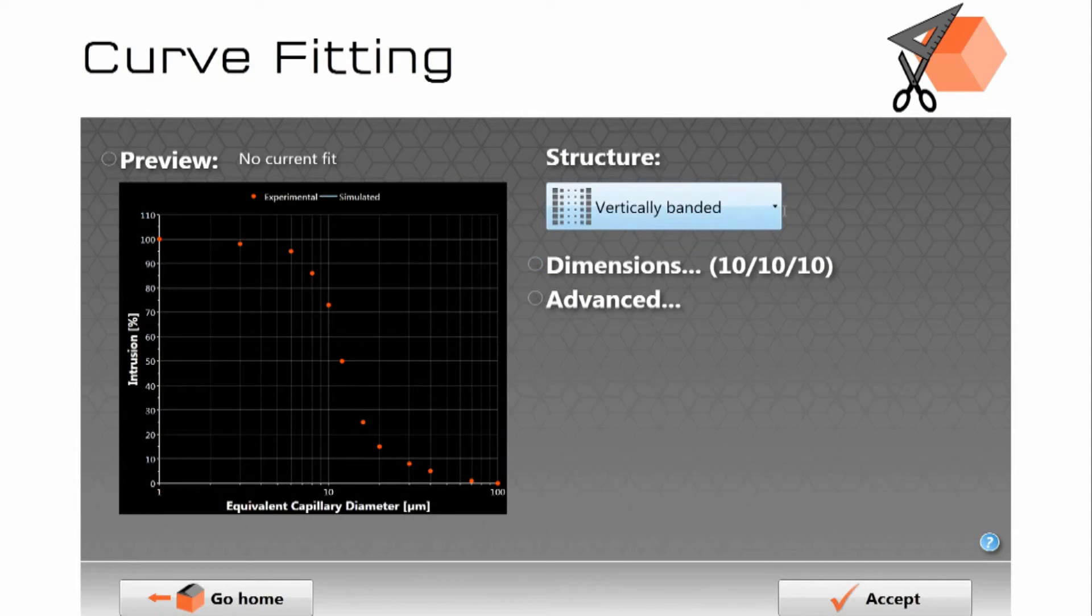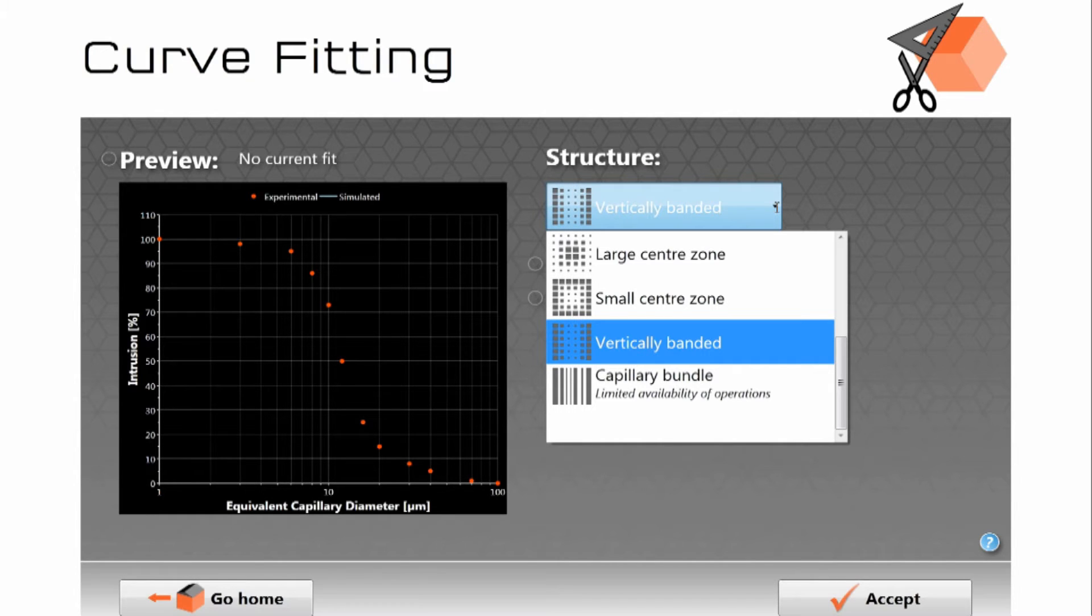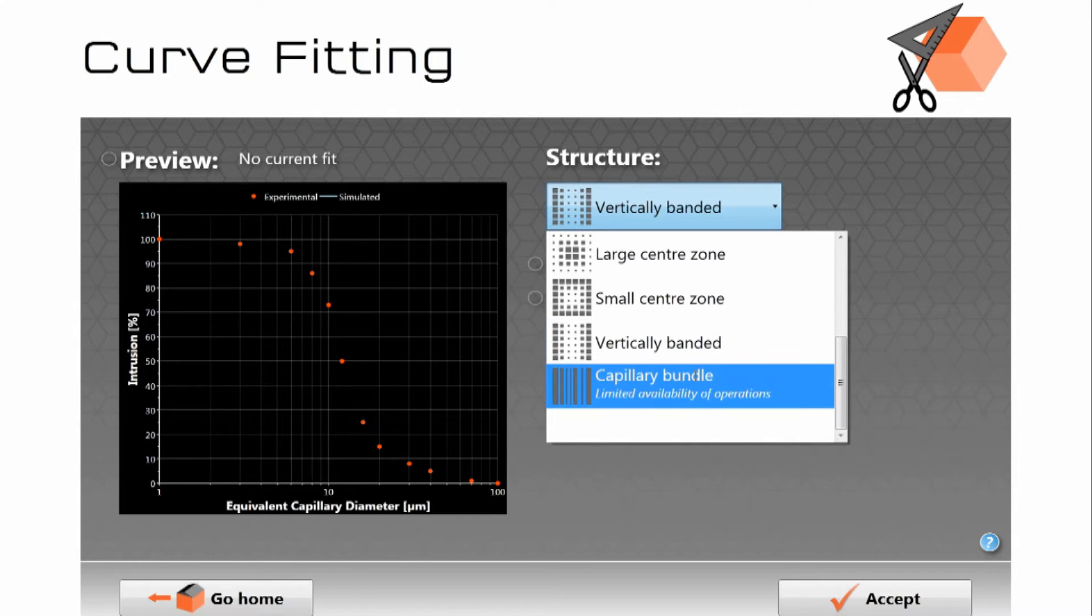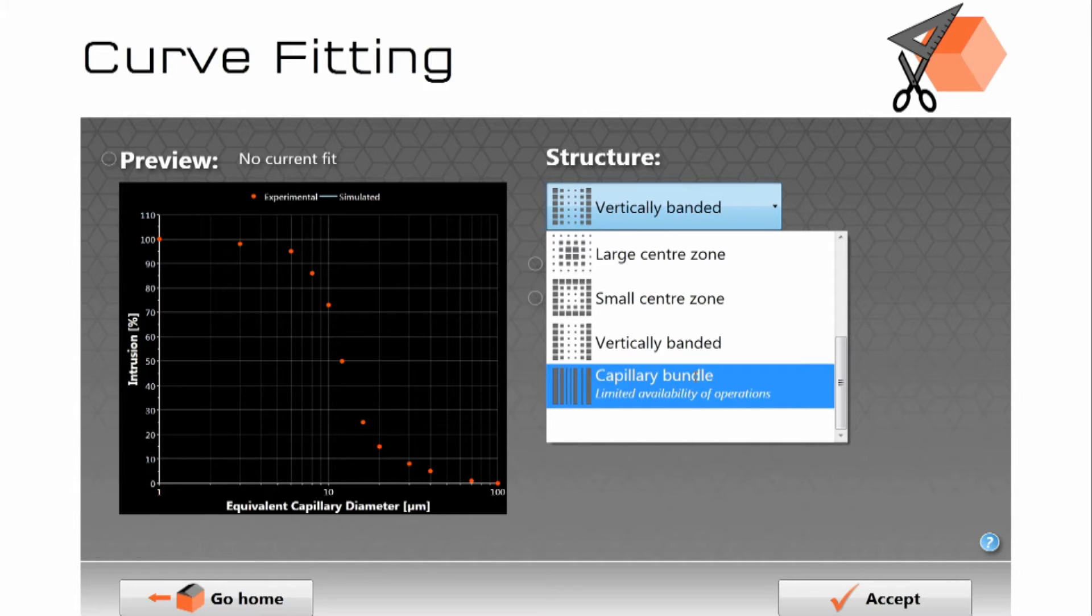We can choose various structure types. To give its proper name this is the short range size autocorrelation function. You can if you like choose capillary bundle which simply takes the first derivative of the mercury intrusion curve. And that's the traditional way of doing it in the literature. That is only entirely valid for specific samples such as track etch membranes.